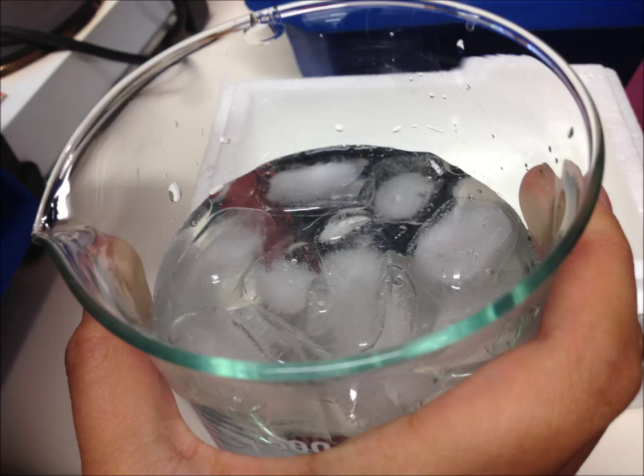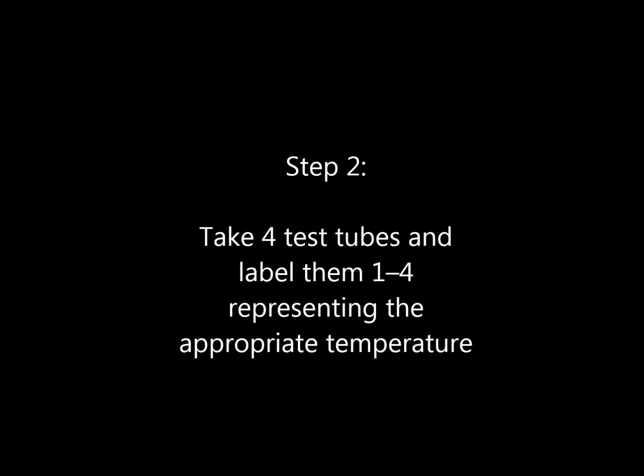Step 2. Take four test tubes and label them one to four, representing the appropriate temperatures.